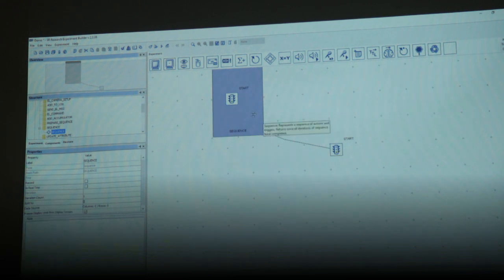Alright. So now the next piece of code has to be within the layer, right, like I explained. You just double click on it and you enter a new layer. Now you see it's completely new, right? So now we are in this frame and on top you would see that a new layer has formed. You can see first one says experiment, second one says sequence. So we are inside sequence now. Now we will build a little more code.